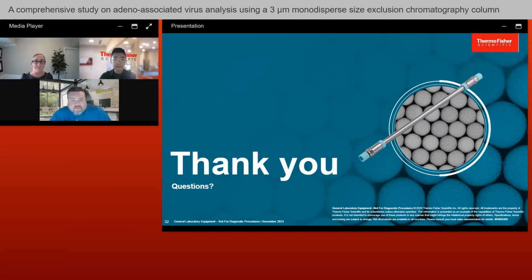Yeah, I'll take that one too, Matt. So when it comes to liquid chromatography, inertness is going to refer to the lack of adsorption of the analyte onto those wetted surfaces of the instrument flow path. So as column specialists, we understand that the largest surface area volume in that flow path of HPLC is the column itself. So while stainless steel is a robust HPLC hardware, it can be reactive and cause certain sticking or peak tailing or loss of analytes for your recovery.